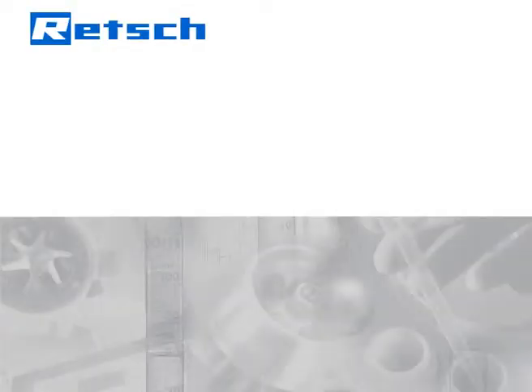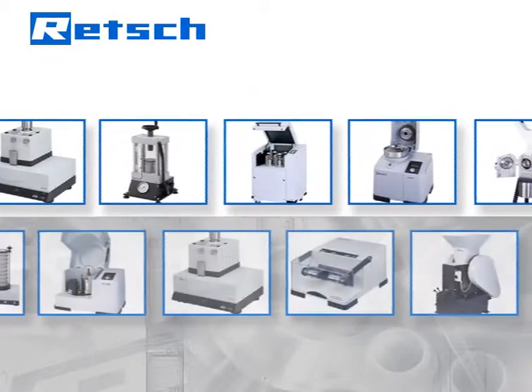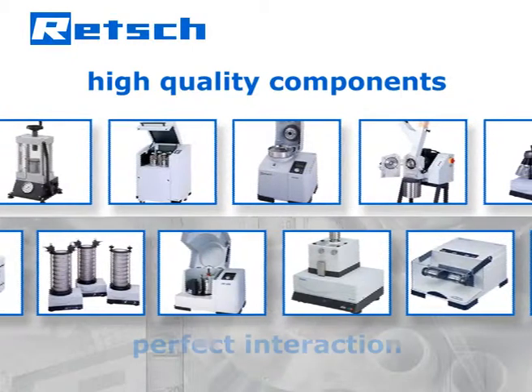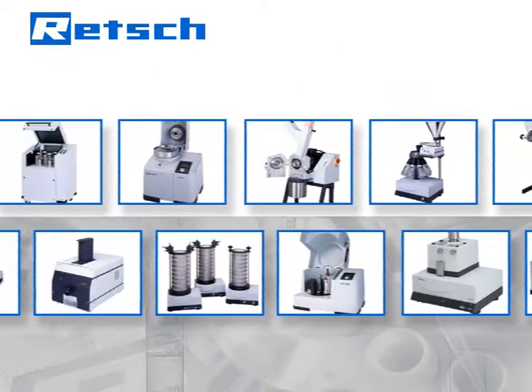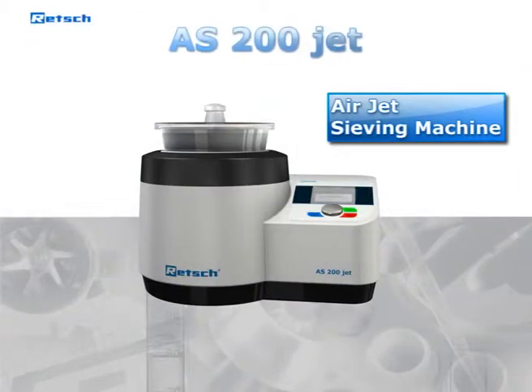Retsch's product philosophy is based on a quote by Aristotle: "The whole is greater than the sum of its parts." Therefore, our R&D department does not simply choose high-quality components, but also pays full attention to their perfect interaction. It is this approach which determines Retsch's products to be superior and makes our air-jet sieving machine AS200 Jet the optimum solution for perfect quality control.